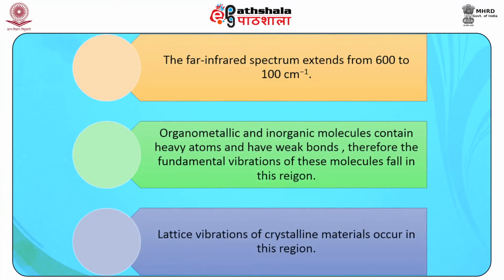Now, the far infrared spectrum extends from 600 to 100 centimeter inverse. Organometallic and inorganic molecules contain heavy atoms and weak bonds. Therefore, the fundamental vibrations of these molecules fall in this region. Lattice vibrations of crystalline materials occur in this region too.